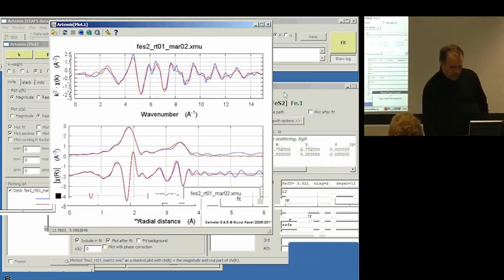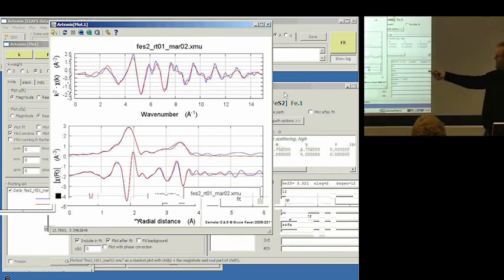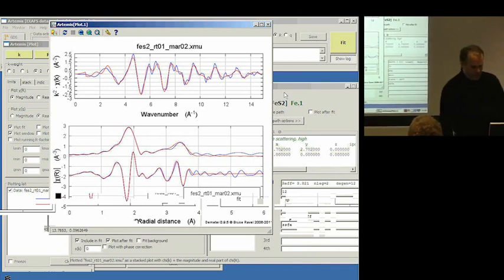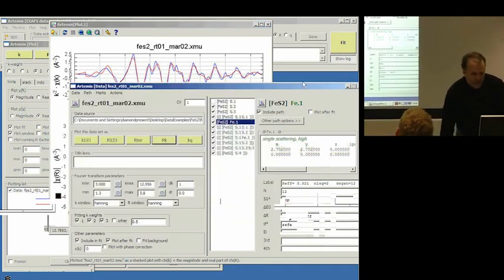Our fit, as I said, ain't perfect. We're missing some stuff. Here, we're missing some stuff. Here, it's just not quite perfect. And before we get into fixing that, I want to make one more interesting plot for you.